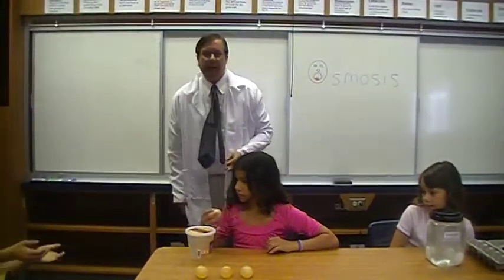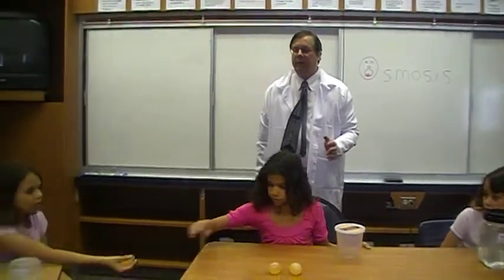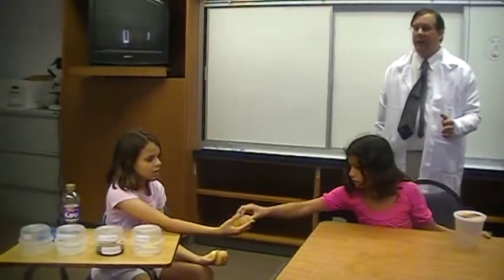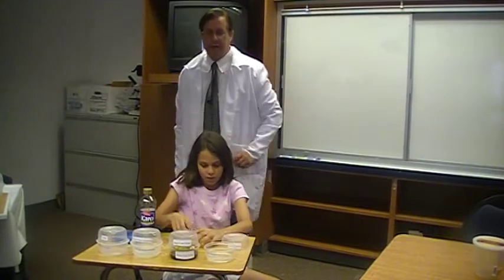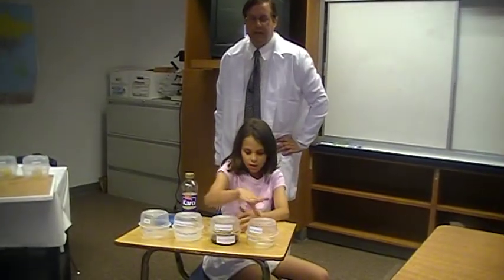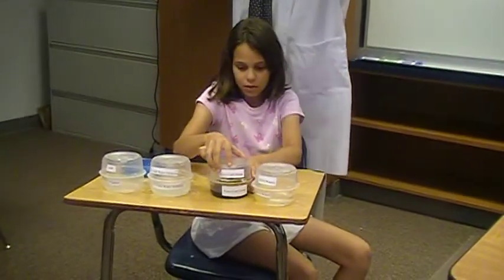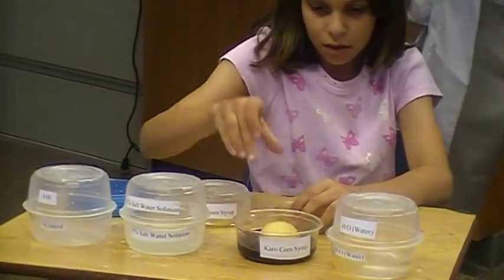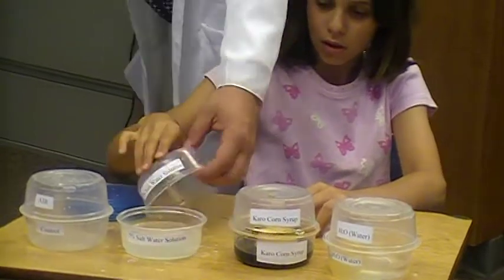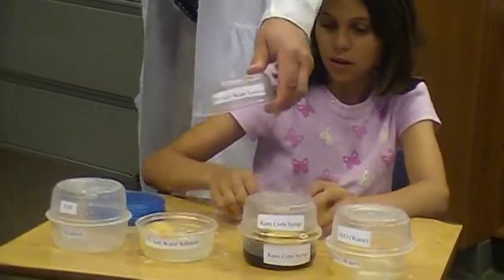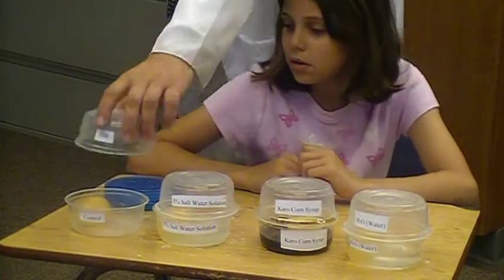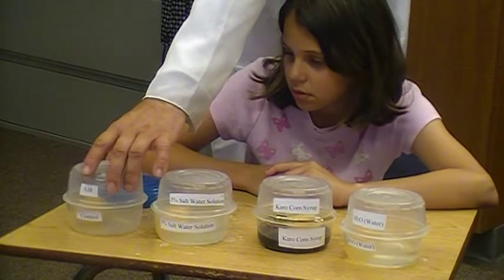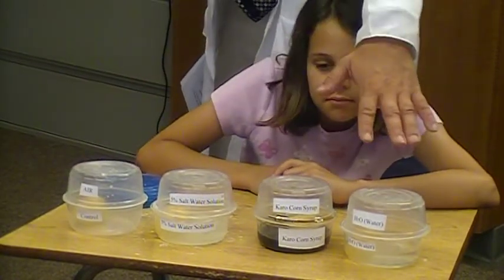Go ahead and hand your eggs to Julia. For the next step in this video lab on osmosis, we're going to take these four eggs and put them into four different jars containing four different solutions — or at least three different solutions; one of them isn't a solution. The first jar contains water, H₂O. Julia, can you put the first egg into that? The second container contains Karo corn syrup, which you can buy at any store. Julia, can you put the egg in that? The next container is a 5% salt solution. And the fourth container contains nothing but air — go ahead and put the egg in that. We're going to use this egg as our control group egg to measure how much these eggs are going to change or not change.